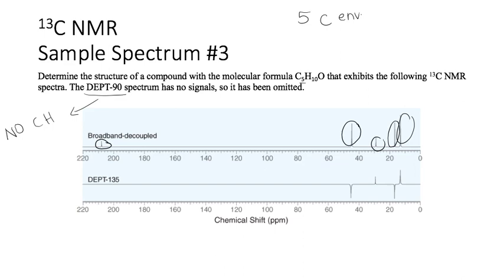Another thing you could check to help you piece things together is still your HDI that we talked about with our mass spec. Again, I just have carbons and oxygens, so I have 5 times 2 plus 2 minus my 10. Oxygens are ignored, and I'm leaving out nitrogens and halogens because they're not here.